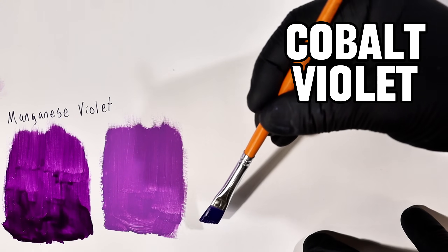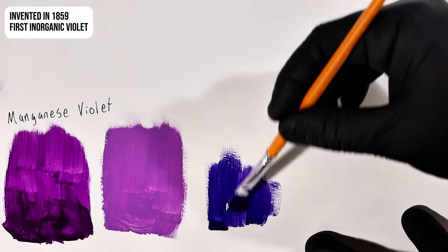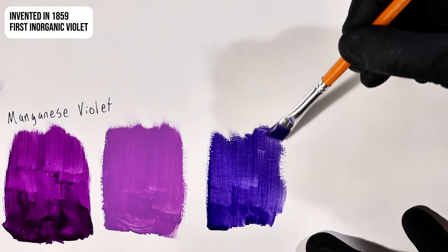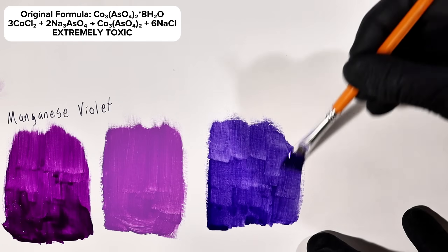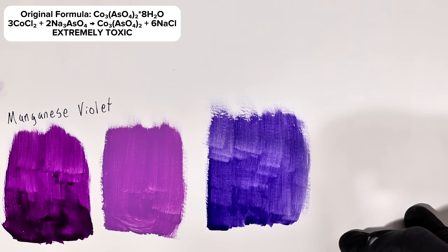Today I'm going to show you how to make a lovely purple pigment called cobalt violet. Cobalt violet was invented in 1859 and was the very first permanent violet pigment available to artists. Its original formula was cobalt arsenate, made by combining cobalt with highly toxic arsenic, and as a consequence it was extremely poisonous.